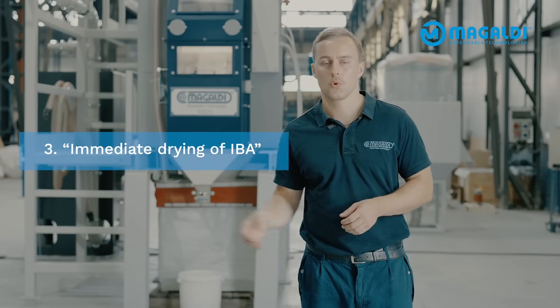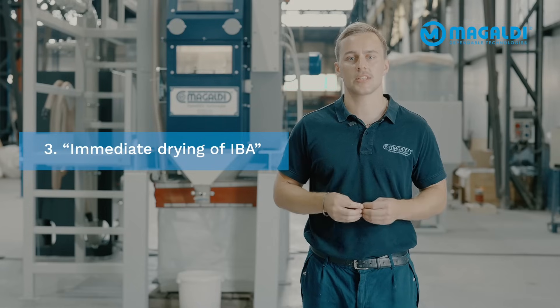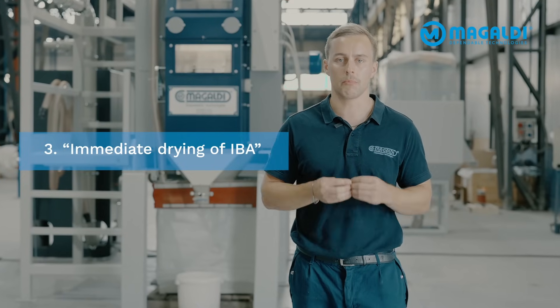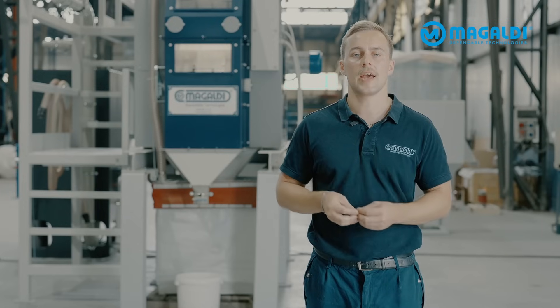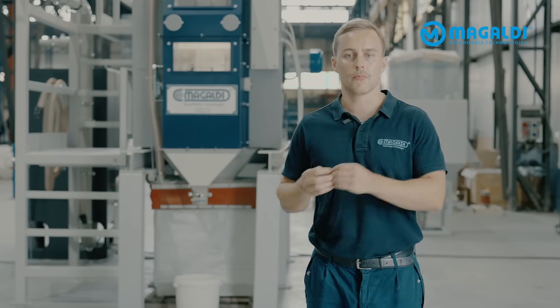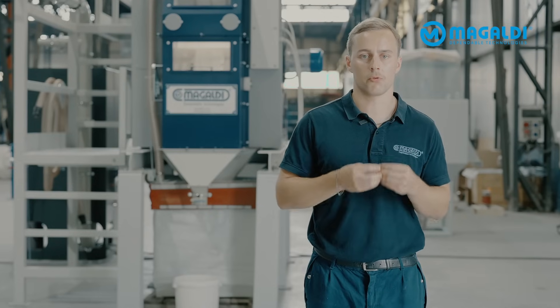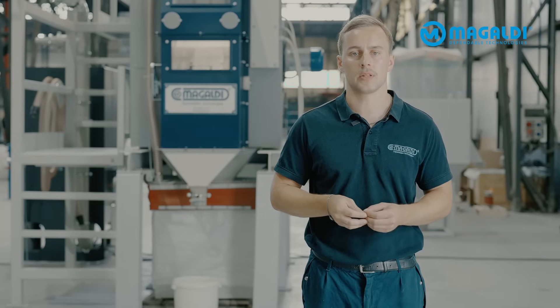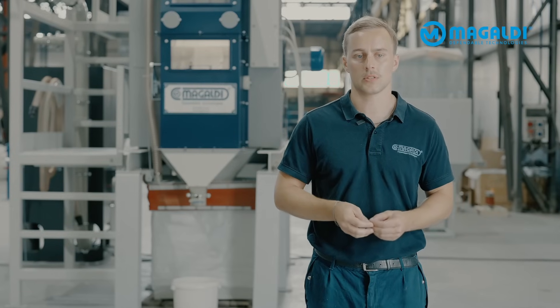Step 3: Once collected, the ash gets dried immediately to avoid any oxidation of aluminium or heavy metal leaching of your precious metals, because this means a loss of metals and an error in your results. And this is the strong thing about dry IBA treatment — you have no metal losses.